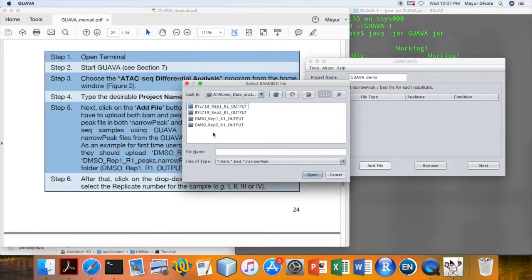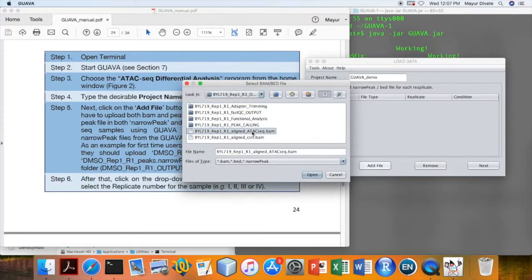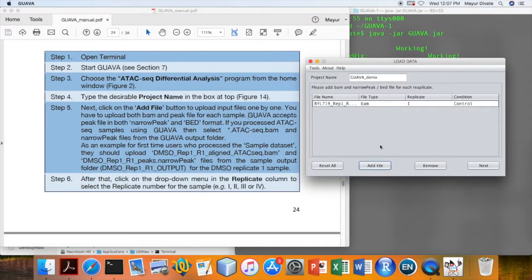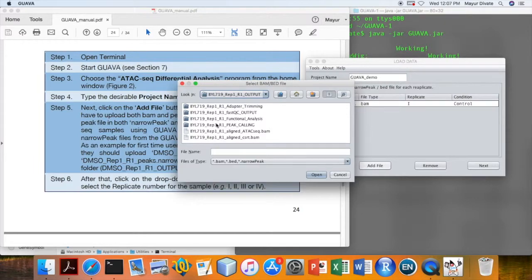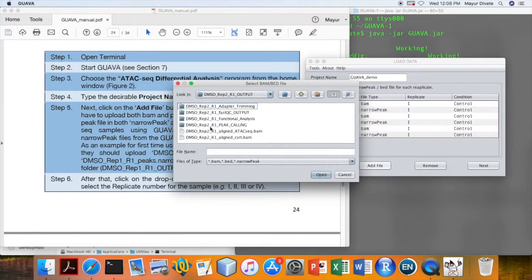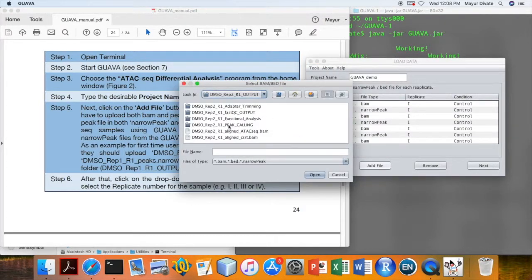Go to the output folder of GUAVA ATAC-seq Differential Analysis program and then select the ATAC-seq BAM file. Again click on the add file button and select the narrow peak file. Similarly add these files for all other samples.